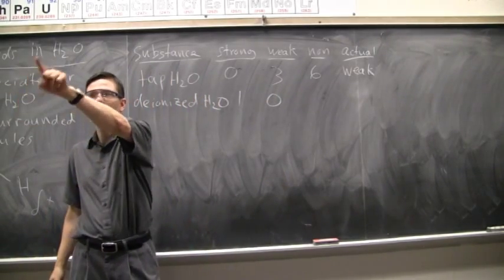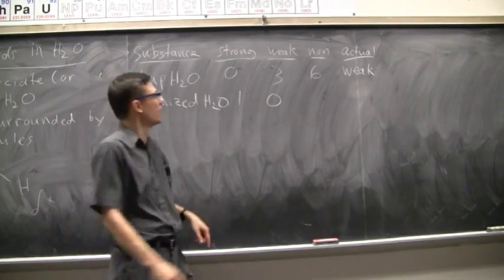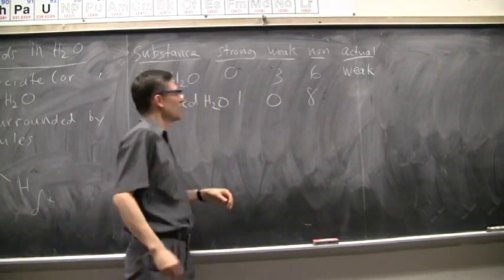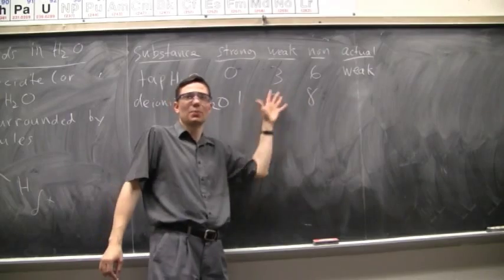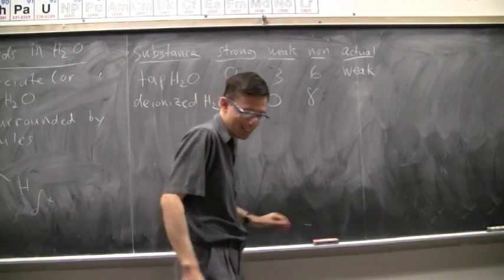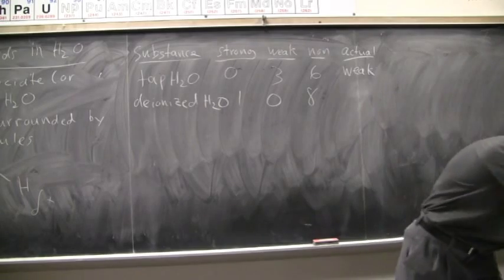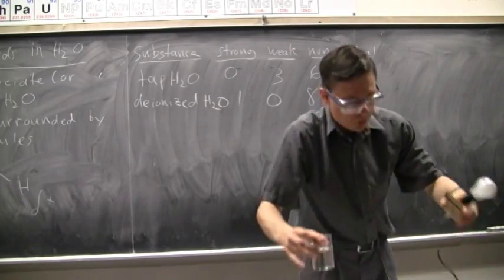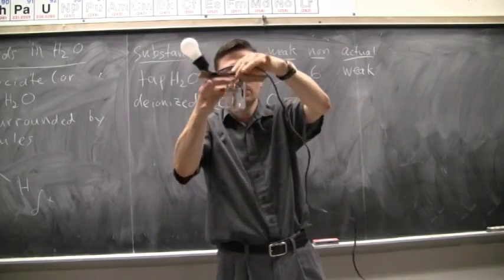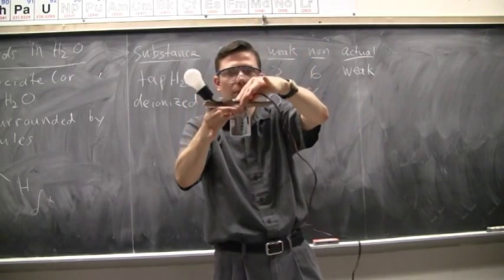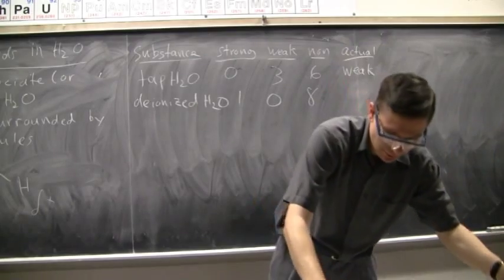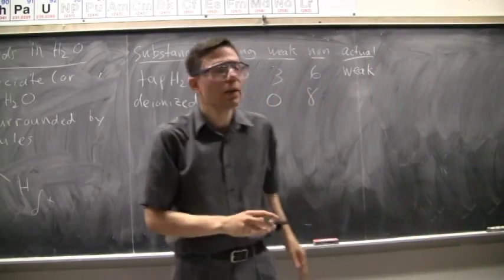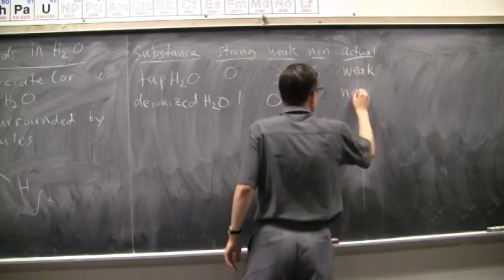Let's see. One, two, three, four, five, six, seven, eight. Look at that two times I rolled hands up. Sometimes I get this, that there's not the same number each time that adds up. So, something must be abstaining, I guess. All right. So, let's see what we get here with our probe. So, there we are. Non-electrolyte.